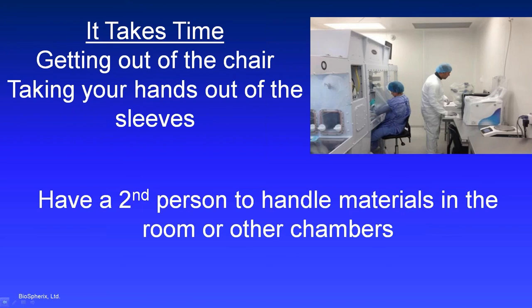Those of you that are coming from an academic world, I'm going to encourage you to have a second person in the room to handle all the materials in the room or in other chambers in the Xvivo, so that person sitting at the processing chamber doesn't have to get up and go do everything.